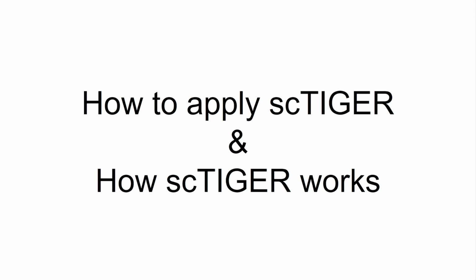Hello, hello. I'm Madison, and I'm going to explain how to apply our pipeline, scTIGER, to your own research. I will also discuss a little about how scTIGER works and the types of conclusions you can draw from using it for your own analysis.